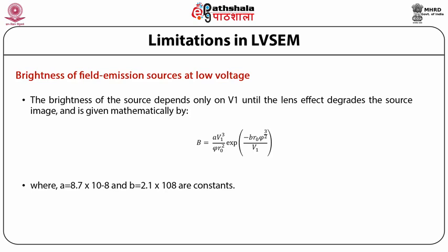Second, the current generated by the source is subjected to temporal instability that produces streaky images.